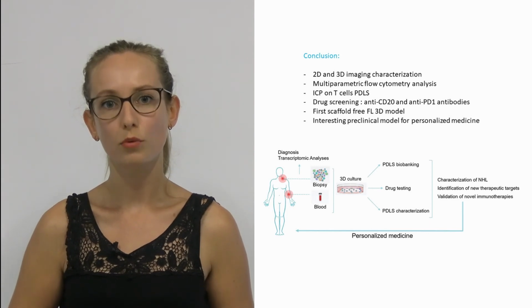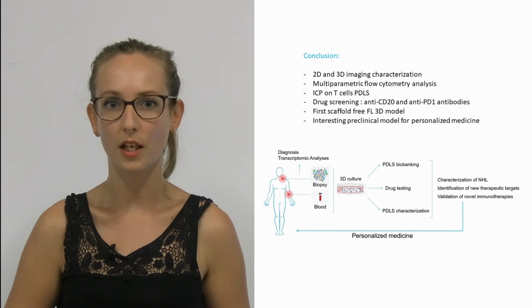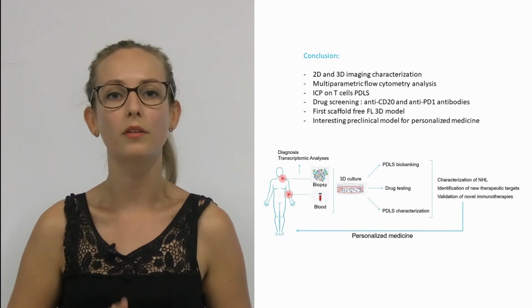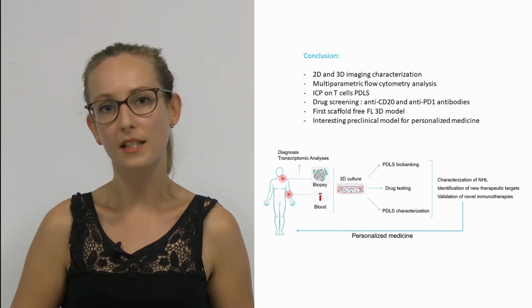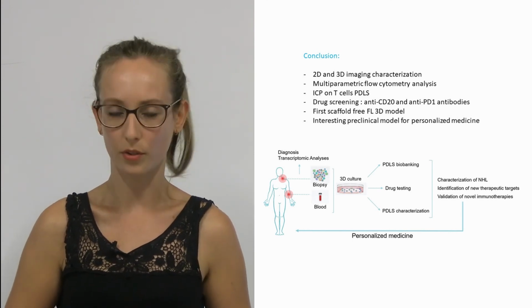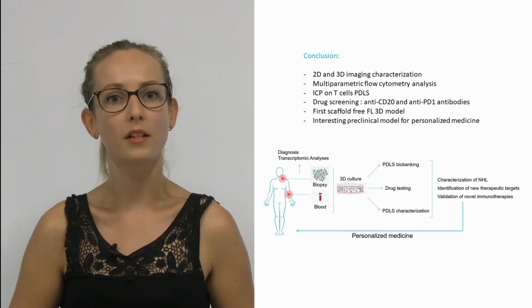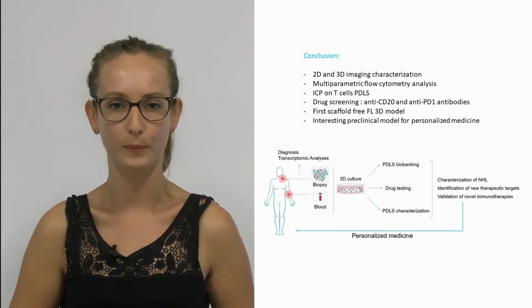Finally, we tested drug screening by using anti-CD20 and anti-PD-1 antibodies combination, and we evaluated the effect on PDLS morphology, but also on lymphoma cell death. This is the first 3D FL model exempt of matrix or other compound used to keep aggregated tumor cells relevant to the pathology with the same pattern of histology. We believe that this model presents strong evidence to become an interesting preclinical model for personalized medicine.